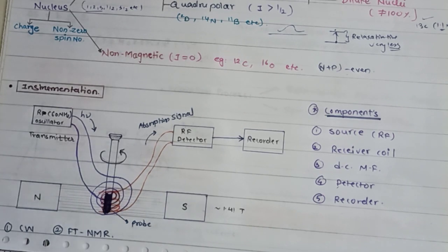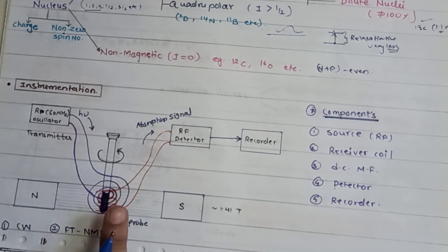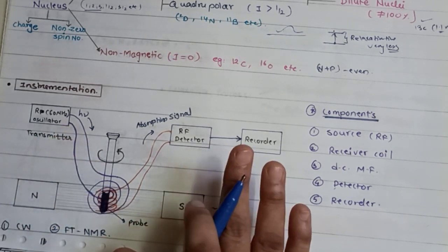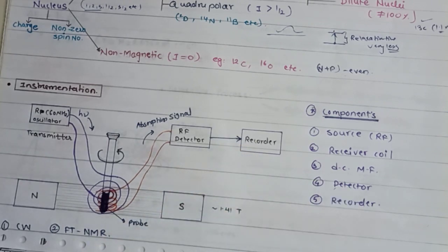And then that NMR tube, meaning your sample tube, is placed where the sample is held in the strong magnetic field and the frequency of the source is slowly scanned, and finally we record your spectrum, okay.